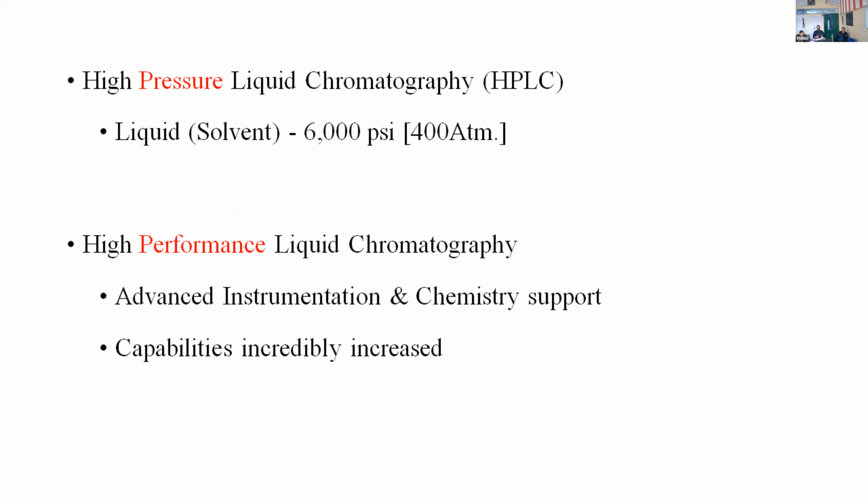Initially, people always knew HPLC as high pressure liquid chromatography, because traditionally in liquid chromatography the mobile phase was pushed at very low pressure, so it took much time to separate the molecules in the column. Once HPLC came into the picture, there was one additional advancement, the high pressure.